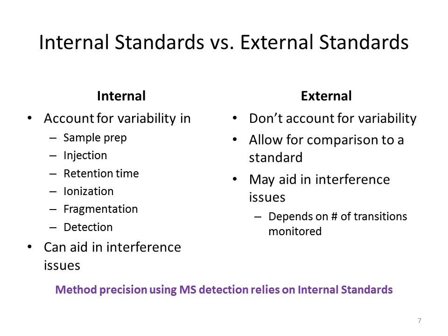That's something that's not done with your sample together. It's done in a separate container, and the data plotted from that standard was generated at a slightly different time or in a slightly different way, and you're extrapolating the information from your sample onto that plot. People do use external standards, and it's common, and there's nothing wrong with it, but they don't account for a lot of the variability we see in mass spectrometry. So in my opinion, it's always a good option, if you can, to use an internal standard.